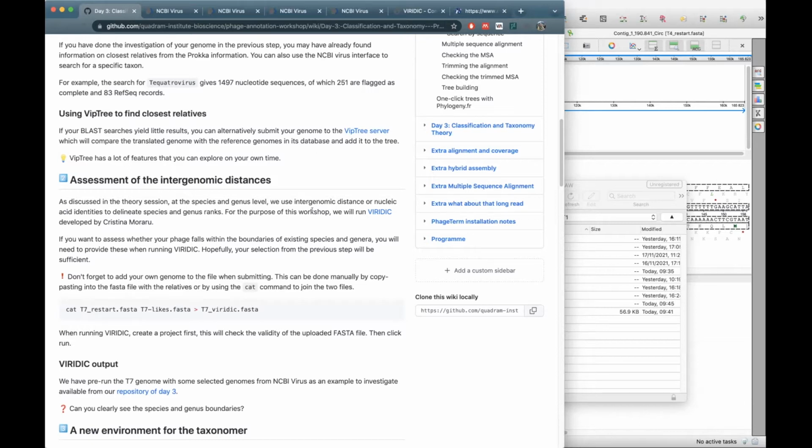So you can easily do that, but in this case, because the file's not that big and the genomes are not that big, it's easily opened. If you deal with files that are thousands of genomes long, and your own genome is very long, then it gets prohibitively more computationally expensive to open these types of files.